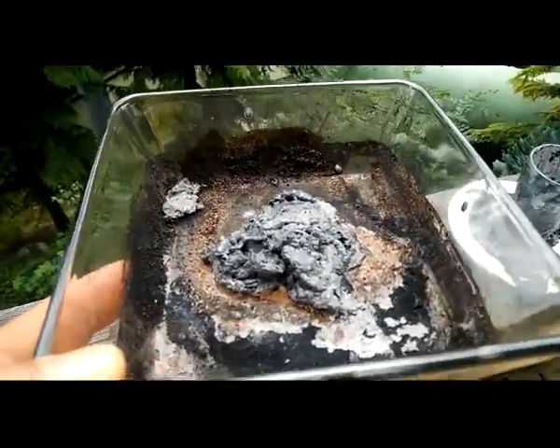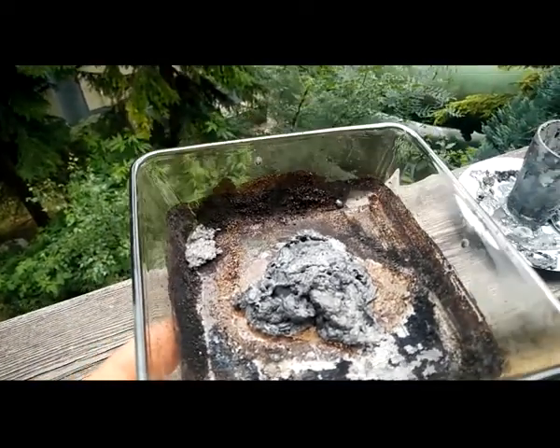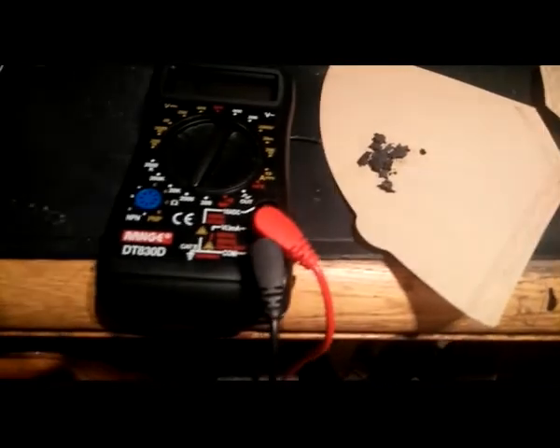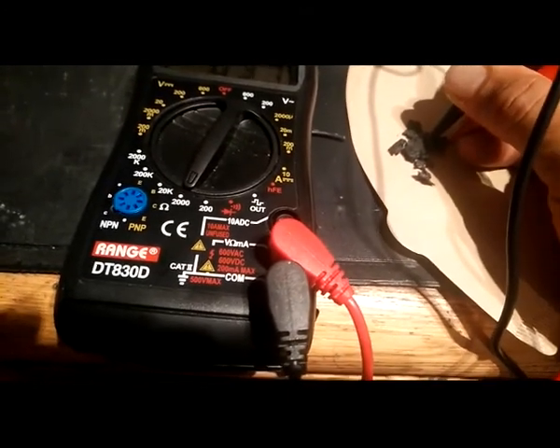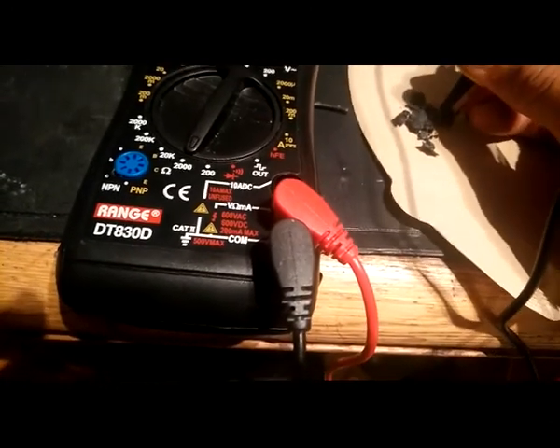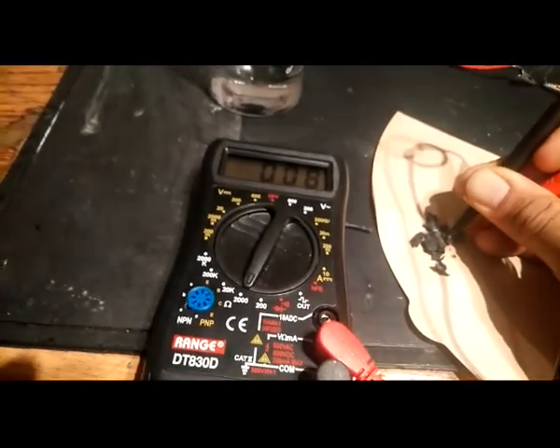Let's try it and carbonize it, let's have a look. Here is the piece of the graphite foam — the conductivity is quite good, about 7 ohms. I try to catch it — 8 ohms.